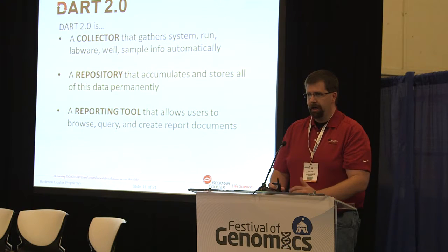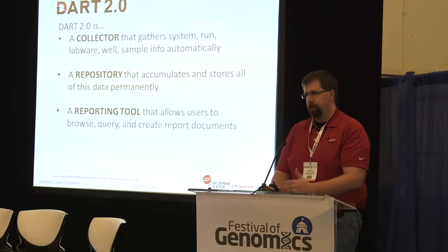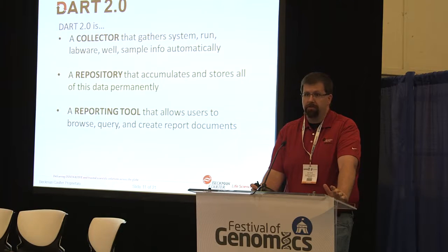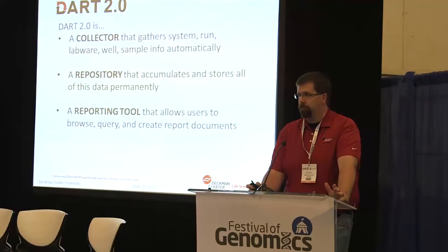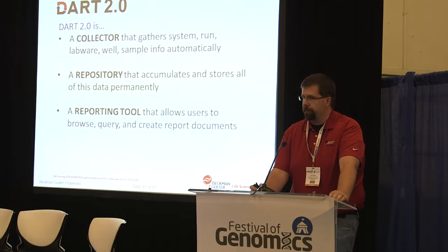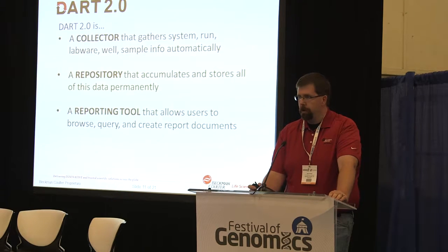Biomek has two different ways of handling data. One is data sets. It's a native function of Biomek software that uses arrays to capture any sort of data you can imagine. Most often it's volumes, but you can put sample ID numbers and whatnot into data sets. And there's also the log files that the instrument generates when it's doing the actual liquid handling part of the process. So DART is able to sample all of those sources of input from the Biomek.